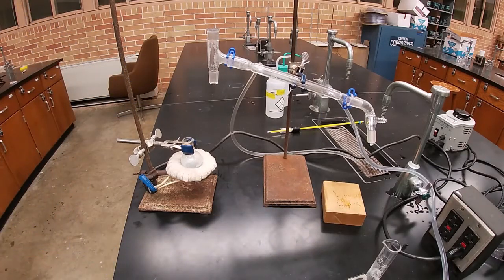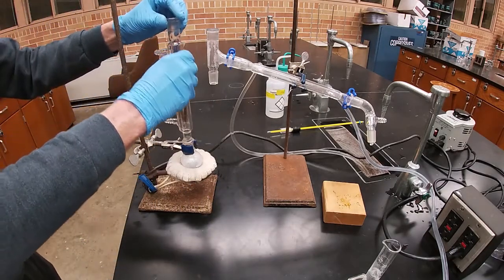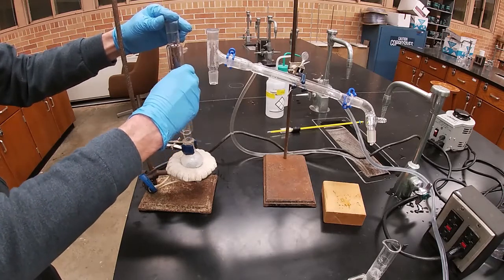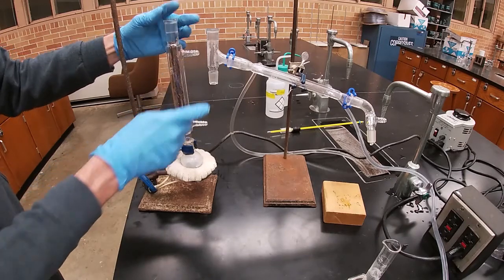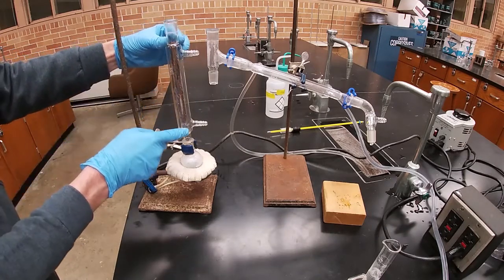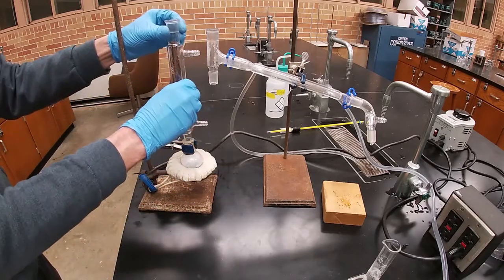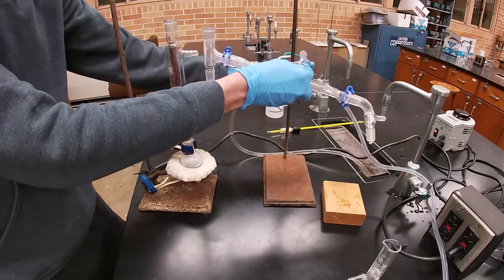If you're going to add this fractionating column, you want to make sure, again, I'm putting a little bit of vacuum grease on the male end of the joint. Insert and twist. Okay. And my fractionating column has some loosely packed copper turnings in there. Okay, if you pack it too tight, it's not going to work. All right. And I'm going to raise this whole apparatus up.